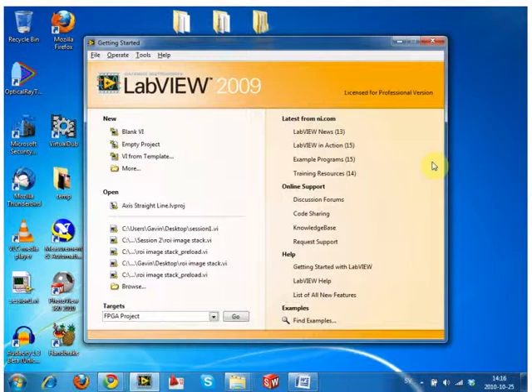We're going to start off by opening the image, displaying it, coming up with some kind of pause system to allow us to draw a box, and then we will go to actually analyzing the stack using the same VI that we did in the first one. We'll use the LabVIEW built-in one because we just need simple information out for this.